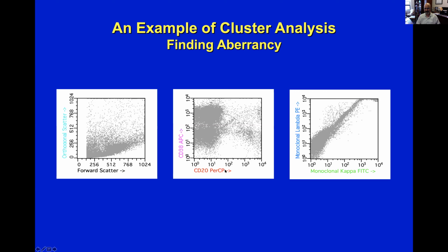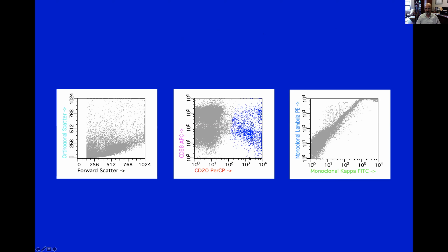The way you approach it is, it's good to start with the lineage specific marker. So on the screen, I would go ahead, take the blue color, or whatever color you want, and I would paint all these cells as potential B cells blue. That would look something like this. And as soon as I paint this based on these two parameters, instantly the software knows what other parameters are saved on these same events, and so it would light up.